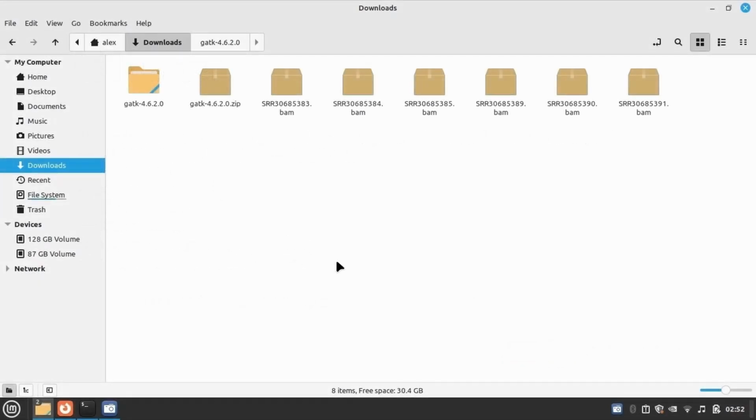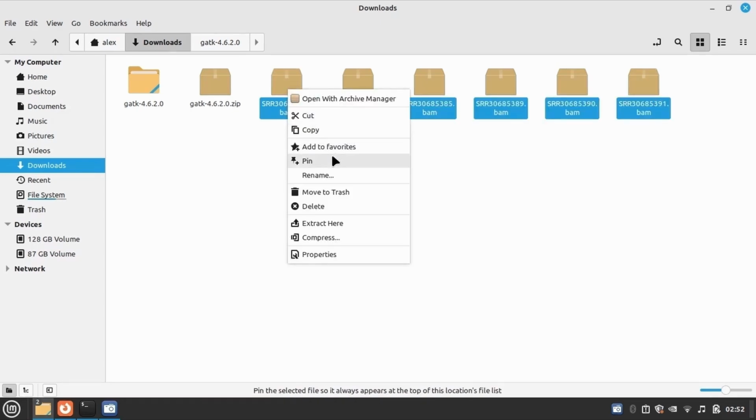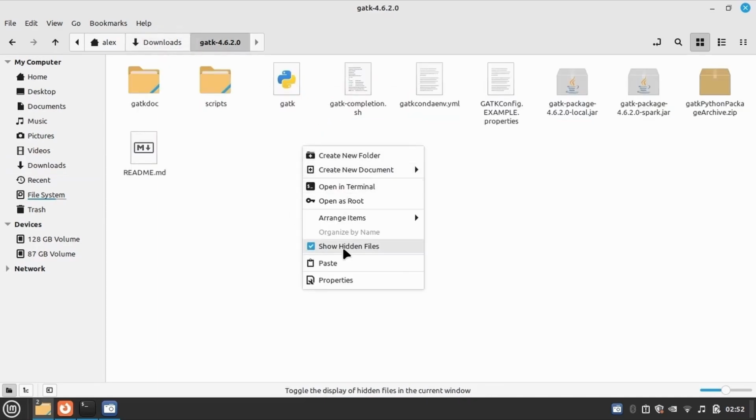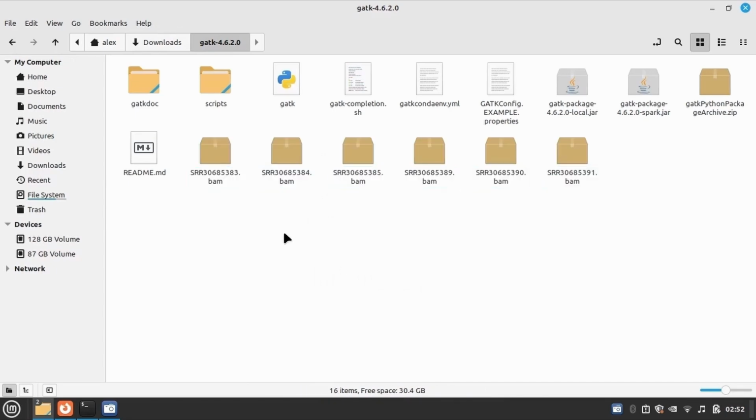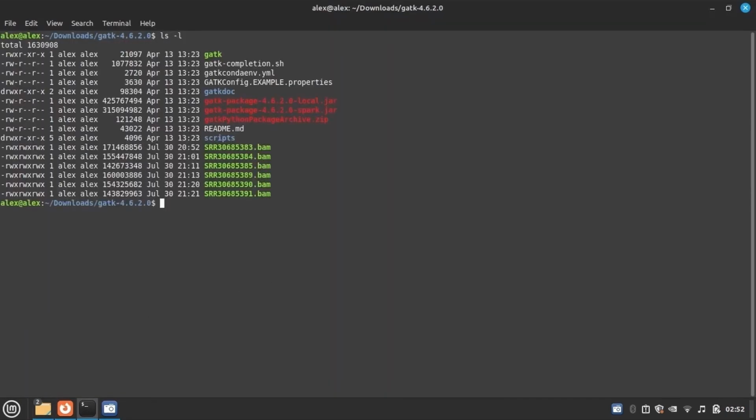To do that, let's copy all our files to this directory. Let's check it.